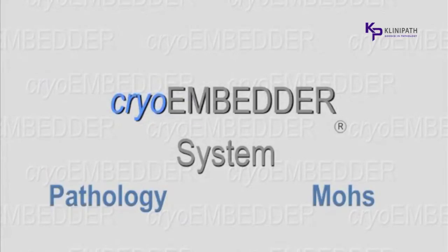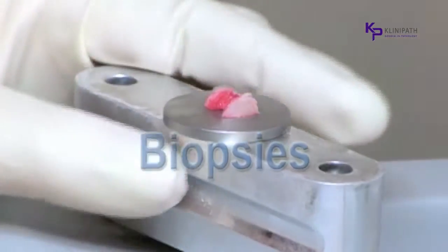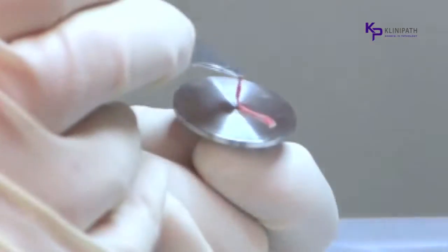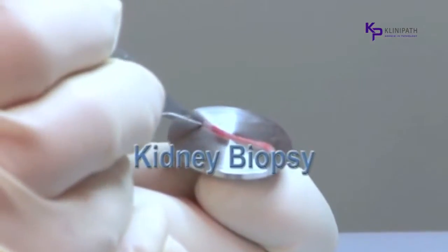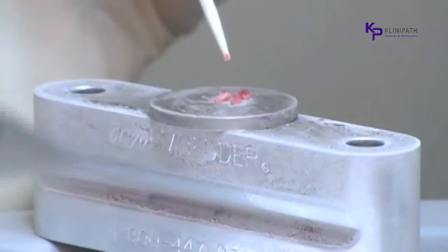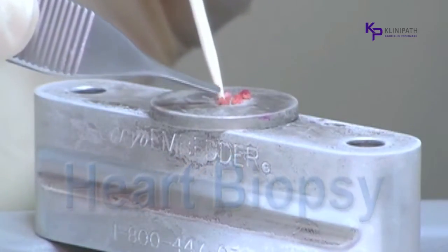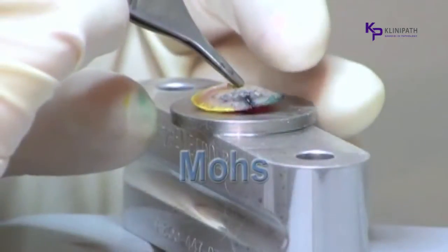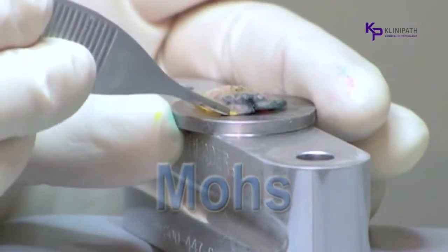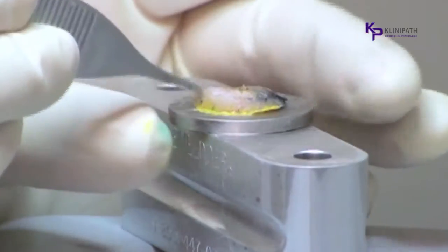This instructional video will be demonstrating the speed and accuracy of processing frozen tissue with the cryoembedder. The first part will be using a variety of tissue samples processed routinely in clinical pathology labs. Part 2 demonstrates its use when processing frozen sections on skin cancer removed during MOHS surgery. Part 1 is shown in actual time, and Part 2 is demonstrated slower for teaching purposes.